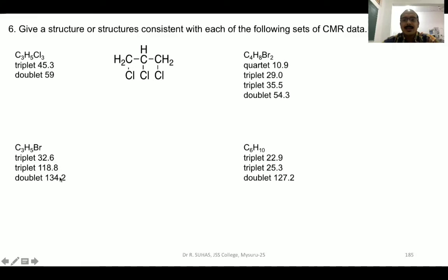So here you can clearly distinguish that there are two types of carbons. One is saturated carbon, and another one is unsaturated carbon, because the value is quite high, above 100, 118, and 134. Essentially, there must be a double bond, and also DBE for this molecule comes out to be 1. It refers to that there is one double bond in the molecule.